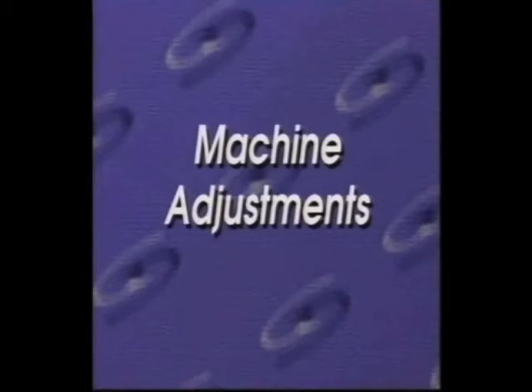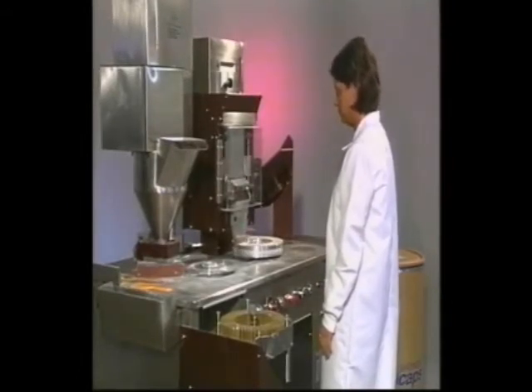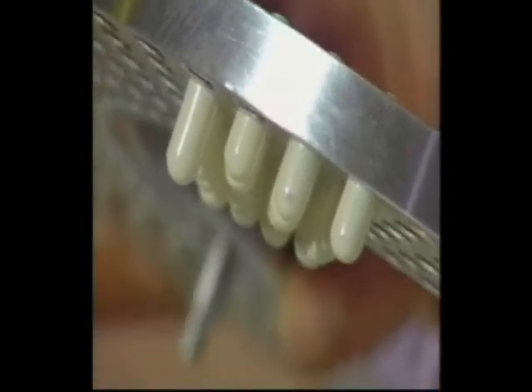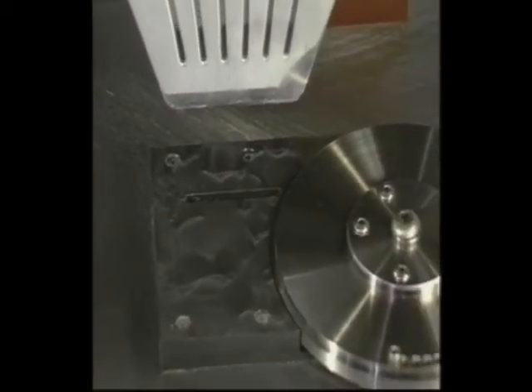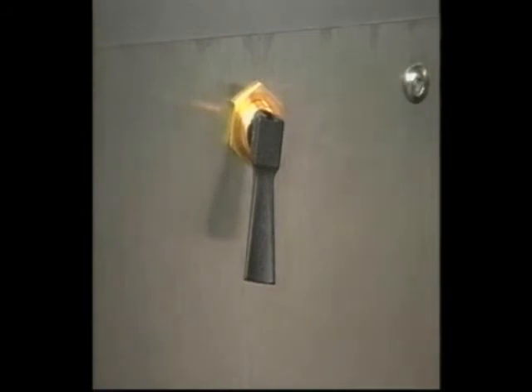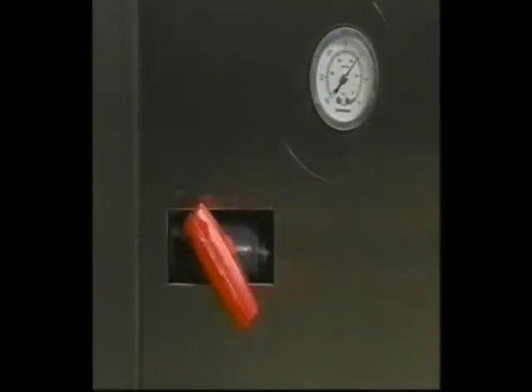If you are not loading or separating your capsules correctly, you will need to adjust your vacuum and rectifier table speed. Your vacuum controls the suction that pulls empty capsules into your rings and separates capsule bodies from caps. If your vacuum is too high, capsule bodies will break or bounce. If the vacuum is too low, you will not be able to separate caps and bodies, or will need to run rings over the vacuum multiple times. To change your vacuum, turn the bypass switch to the up position, which starts the vacuum without running the rectifier. Check your vacuum gauge — it should read between 9 and 12 inches of mercury. Turn the red or orange valve knob to adjust as needed, then flip the bypass switch down to shut off the vacuum. Note that different manufacturers' capsules vary, so you may need to adjust outside the 9 to 12 inch range to achieve proper separation.